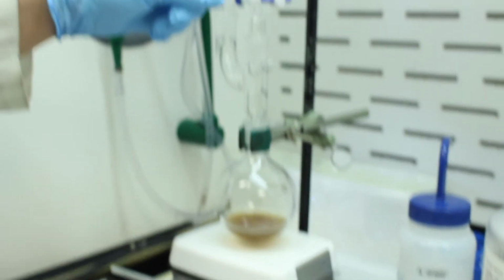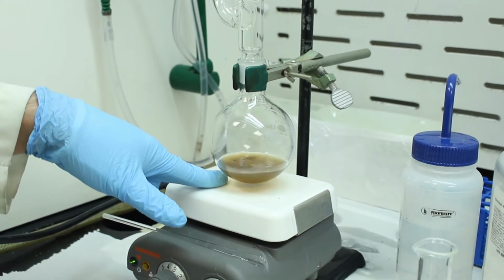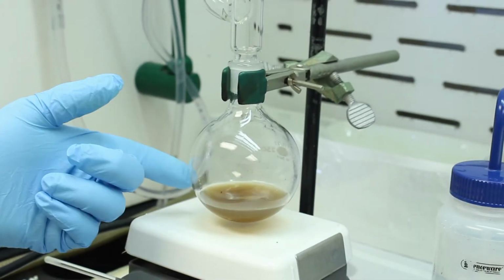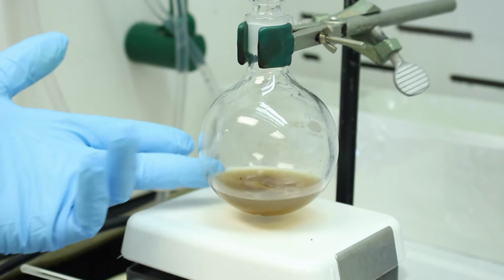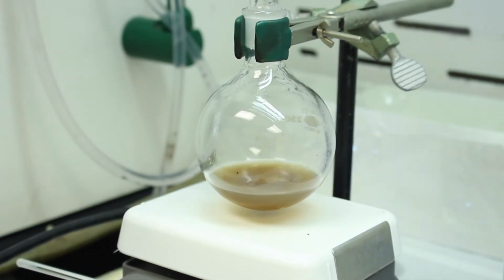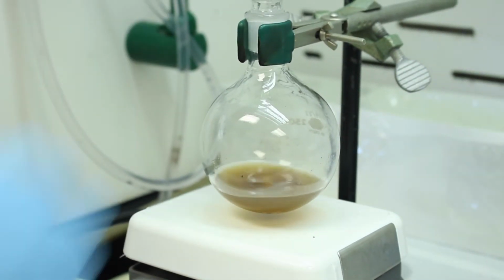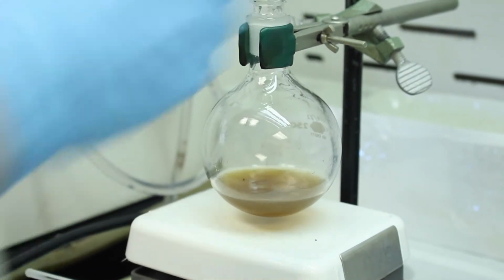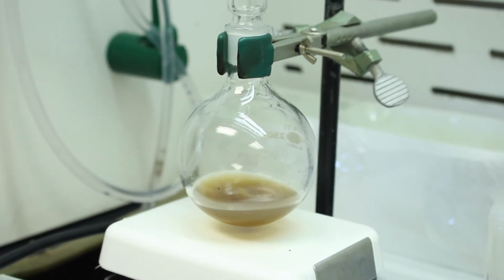Anyway, so we have our benzophenone in here, and we're going to react it with our Grignard reagent. Now this reaction is very fast, so it occurs basically spontaneously, and you'll see a rapid color change. It's very nice to watch. And when we add it, we're going to be careful to add it slowly, because the addition is exothermic, and it's so exothermic, in fact, that a lot of ether escapes out the top. So we're going to try to add it slowly. Now, in fact, why don't I turn the sep funnel this way so I can turn this. So watch closely, because there's a cool color change that occurs.